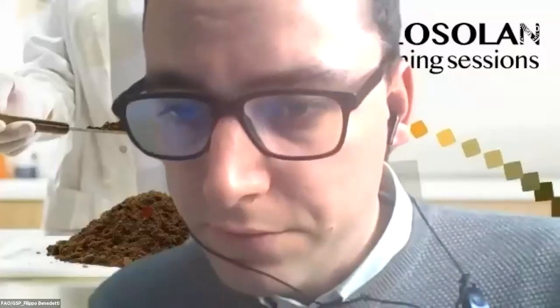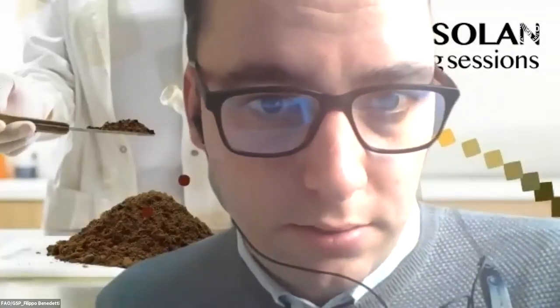Filippo, I don't know whether you can hear us. Maybe you can write in the chat. We do that by hand to transfer. Okay, by hand. So you use your hand. In our lab, by hand, not mechanical. Okay, thank you.